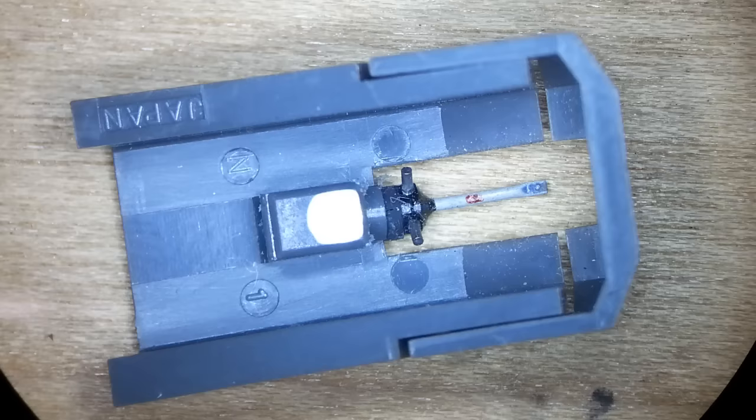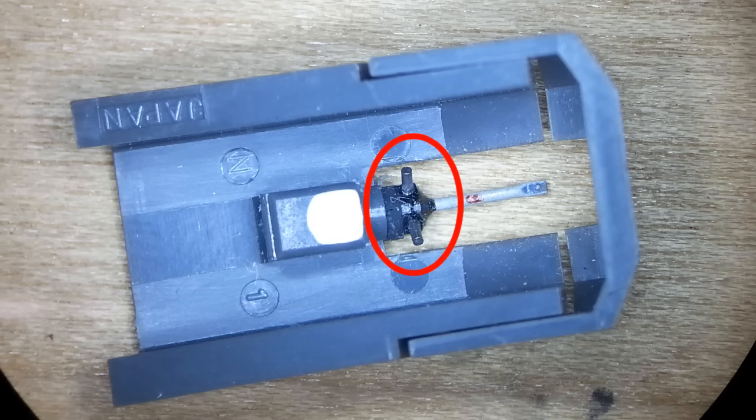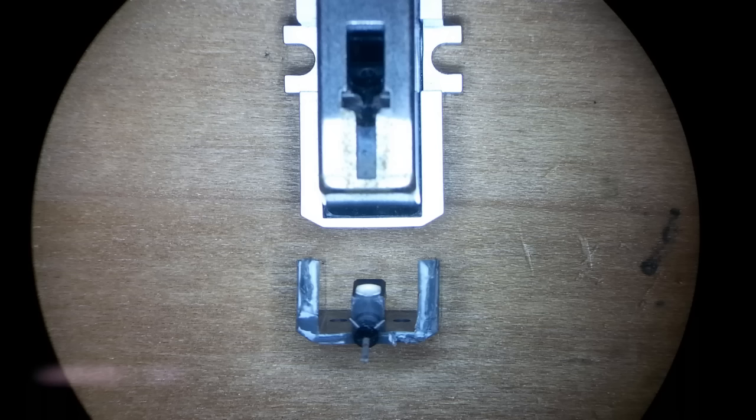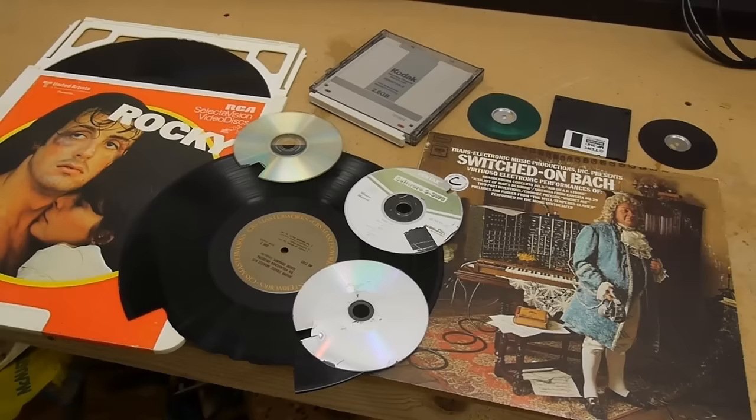The way this works is that the stylus vibrates because of the grooves in the LP and it moves the magnets near a coil and that's what generates the electricity that gets amplified into the audio signal. Unfortunately if we put this directly in the electron microscope those magnets would deflect the electron path and distort the image. So I pulled the magnets off of the stylus.